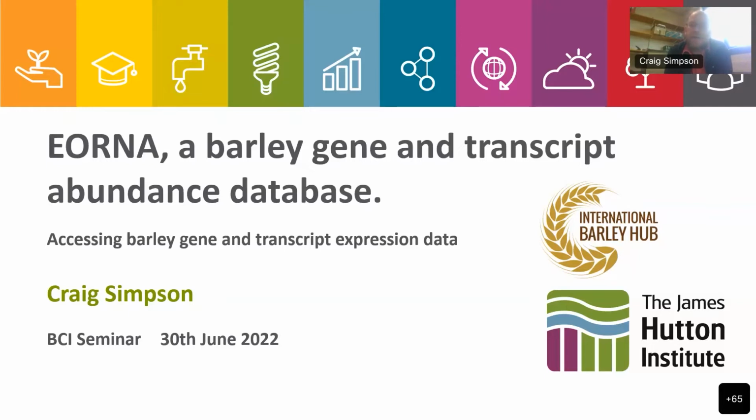And then the second part is the practical part, which Robbie was asking us to set up. So I'm going to try and do this live. So if you do have a FASTA file, I'll unshare and I'll grab that FASTA file and we can put it into EoRNA and see how it goes. If not, I do have one example I can show you as well to show you how quickly and easily you can generate information and data. So I'll just start from there.